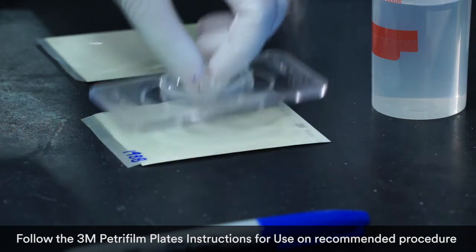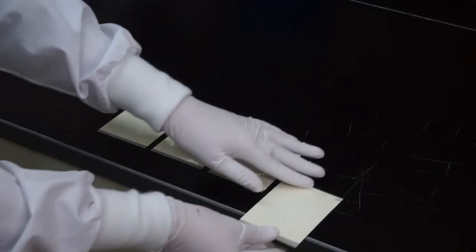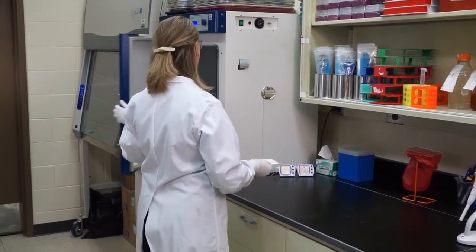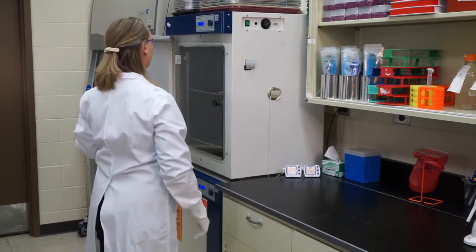Second, incubate. A compact incubator is ideal for 3M Petrifilm plates because no bulky agar dishes or instruments are needed. 3M Petrifilm plates contain two layers of thin film, providing a space-saving size requiring less storage and less incubator space.